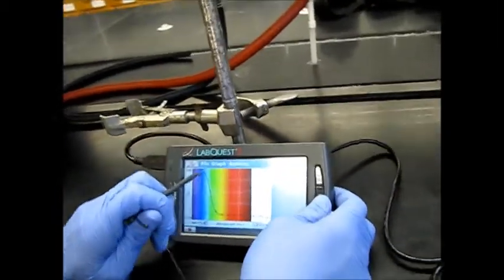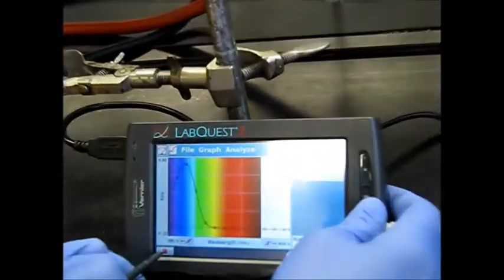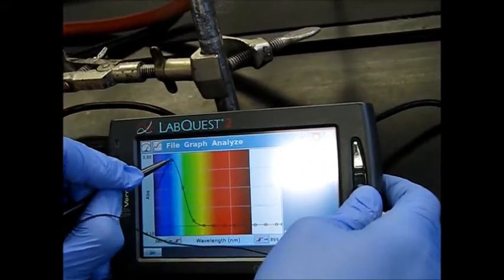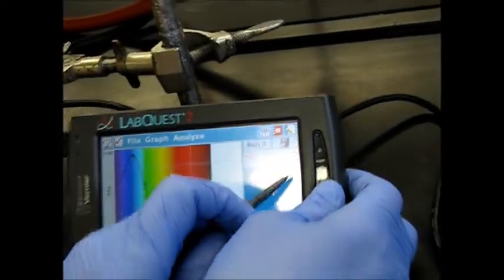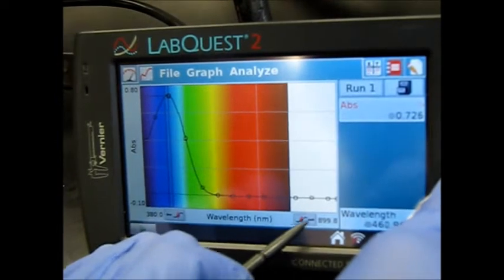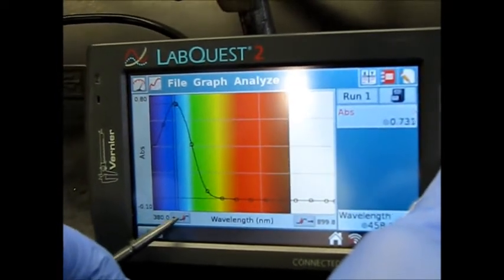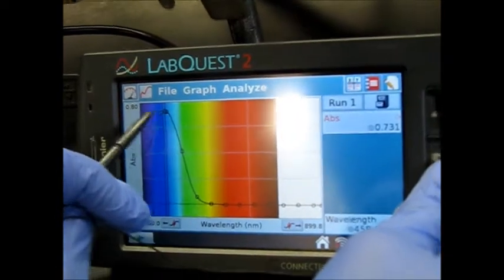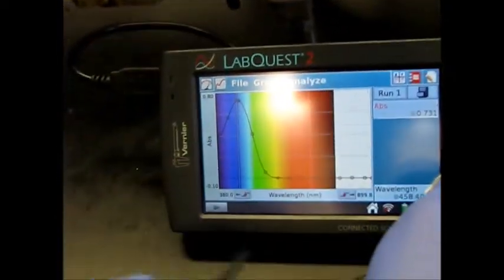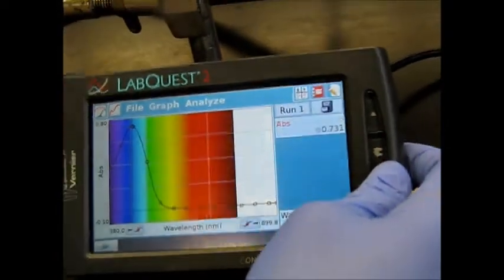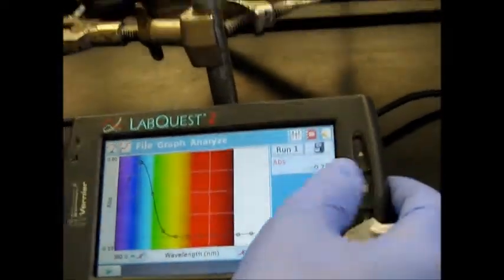Alright, so our absorbance maximum. So our absorbance maximum here, right at 0.729, might be a little bit higher. It's lower, 731 looks like. Cool. So that's the very peak of our graph right here. So that's the absorbance that we're going to be using. We're going 731. Like 731.